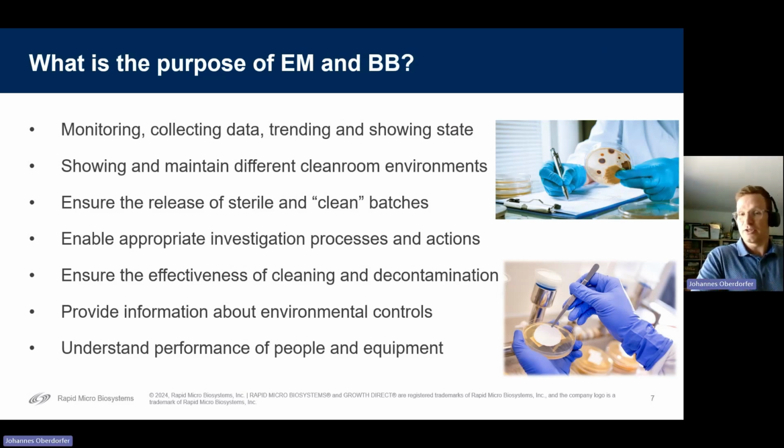If not, then we will also get the feedback that we have out of control in our environments and in our clean rooms, and then we need to adapt. They provide information about the environmental controls, so the different entries and different media that we have to control. And then we also understand the performance of people and equipment.